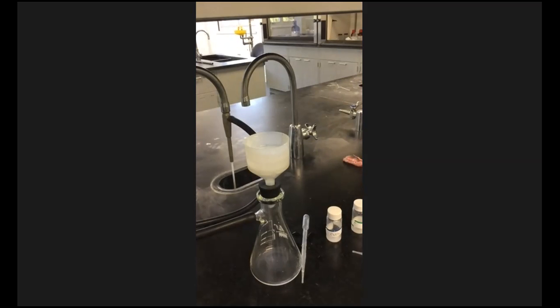All right. And again, this is like watching paint dry. So I'm gonna stop here and finish the filtration, and then I'll send you the numbers this evening. Probably when I get back home, because I got to drive back to Prattville. Or I may do it before I leave here. All right, but either way, that's the limiting reactant layout. So we ran the reaction, we digested it, and then we did a test to see which one of those two parts of the salt mixture was limited, and it showed to be potassium oxalate.